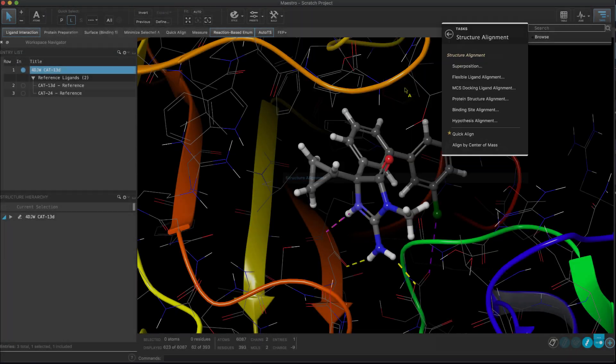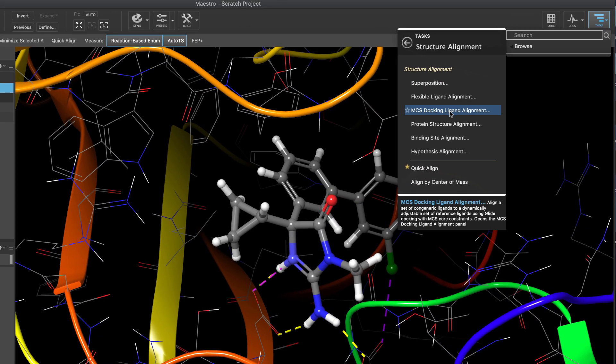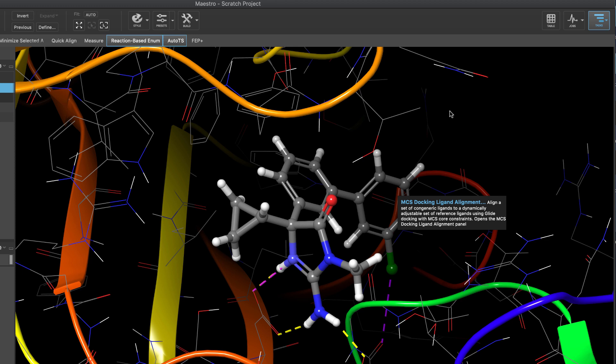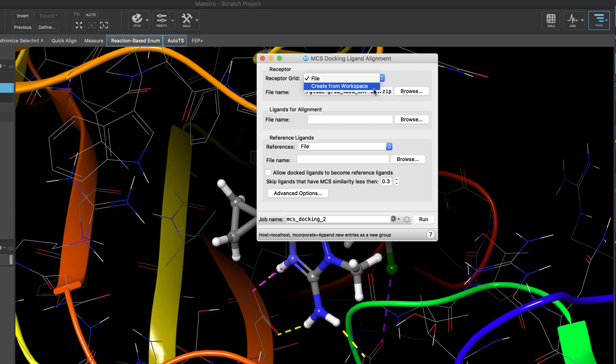In support of FEP Plus, a new MCS docking ligand alignment panel is now available. The panel generates ligand alignments ideal for FEP Plus by MCS docking across one or more reference ligands in one or more protein structures. Simply define a reference grid by either creating one from the workspace or loading one from file.